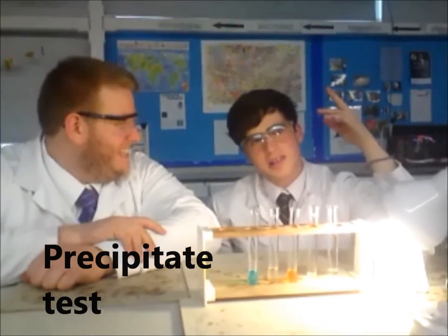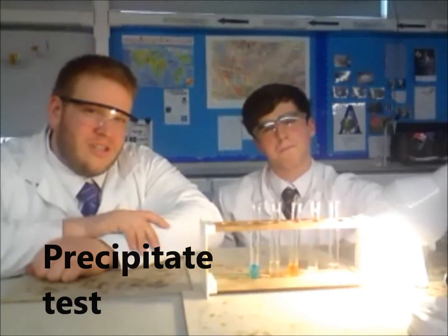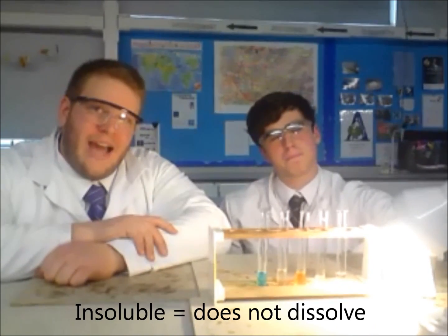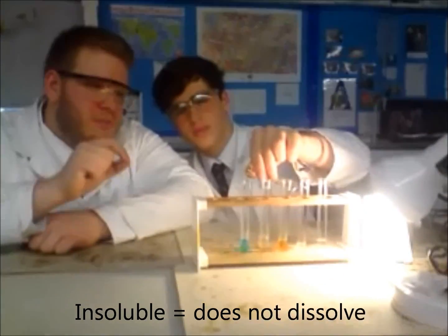Another way of testing for metal ions is to do a precipitate test. Many — in fact most — metal hydroxides have insoluble precipitates. So adding sodium hydroxide to them causes a solid coloured precipitate to form.